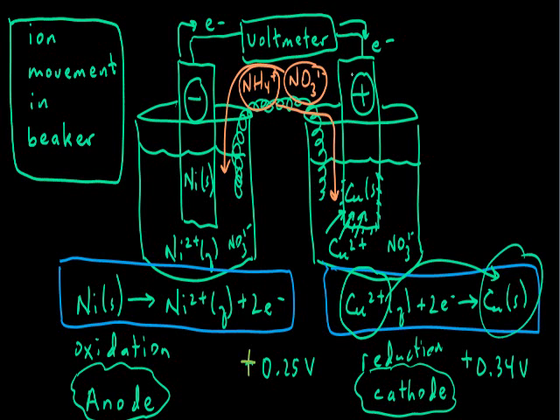Meanwhile, in the opposite beaker, we'd see that the nickel is turning into aqueous nickel ions. So the positive ions are actually flowing away from the elemental nickel. Over time on this end, we would see the end of the strip start to degrade, and the mass of the elemental electrode will actually diminish over time as the solid continues to move off and away from the strip as it turns into aqueous nickel ions.